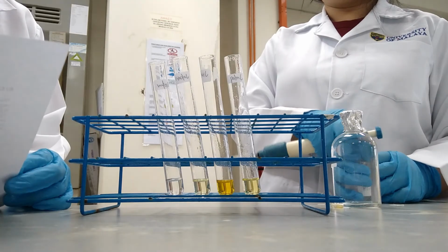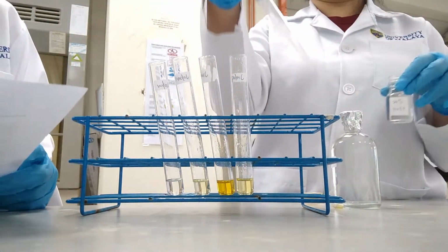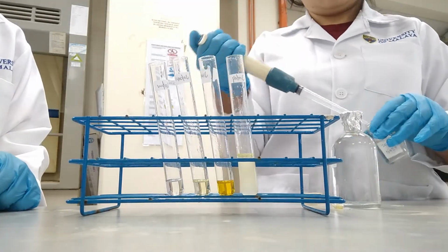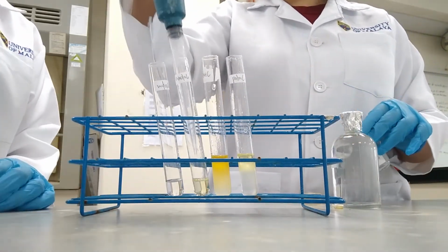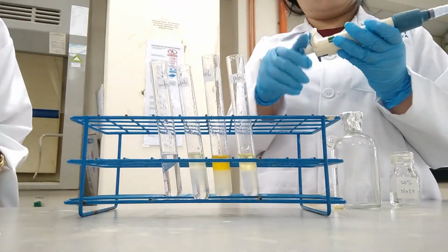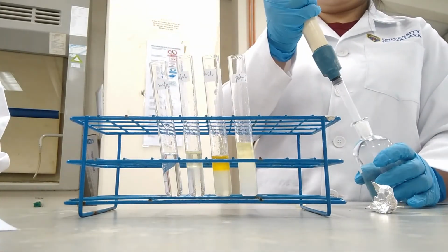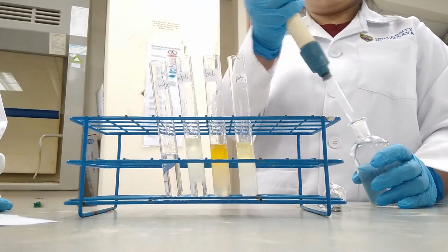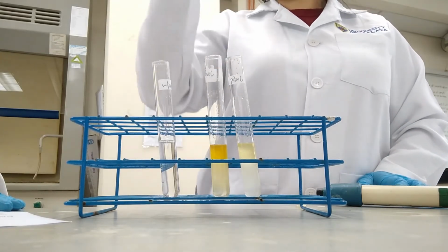First of all, 2 grams of oil was weighed and pipetted into the test tube. 4 ml of 20% sodium hydroxide solution was added into the test tube, followed by 2 ml of ethanol. And the solution is mixed well.